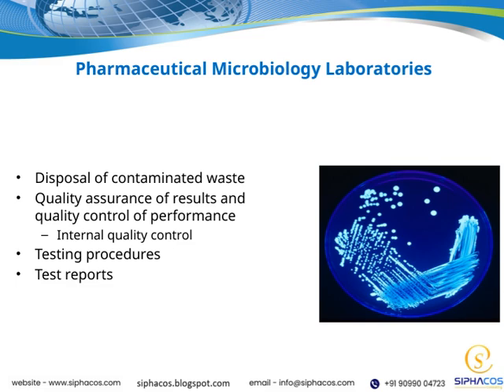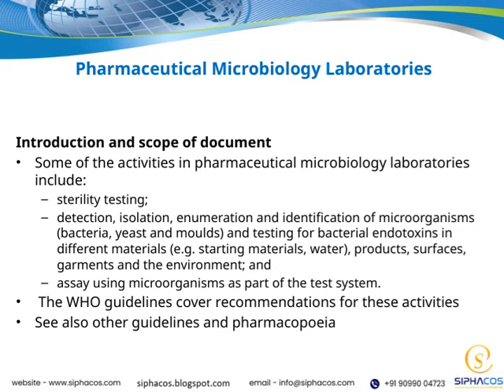All these elements are interconnected and form the backbone of a robust microbiology laboratory, ensuring that our products are safe and effective for consumers. In this slide, we're focusing on the pharmaceutical microbiology laboratories, and I want to start by emphasizing the scope of what these labs do. They play a crucial role in ensuring the safety and quality of pharmaceutical products.